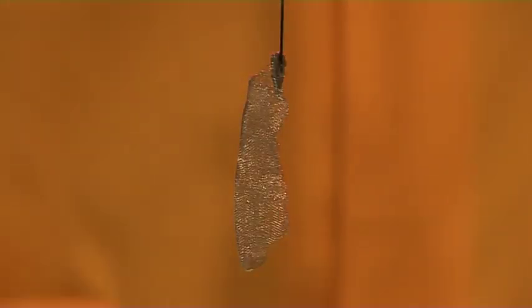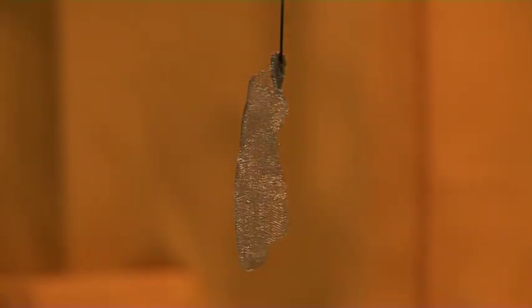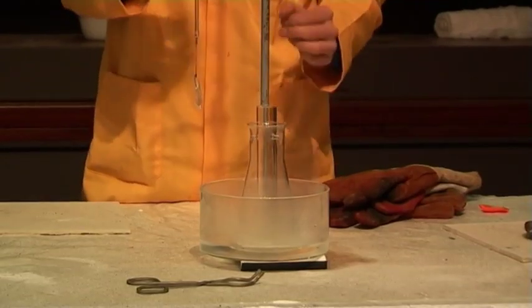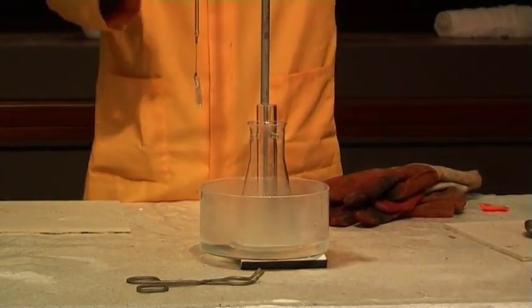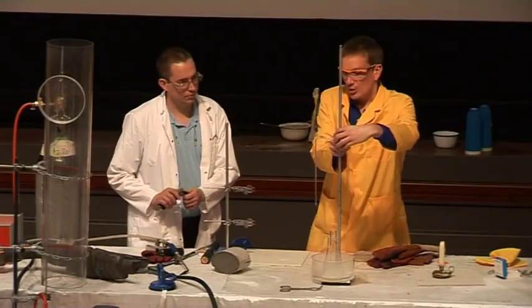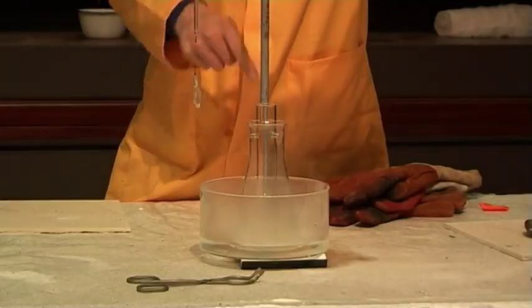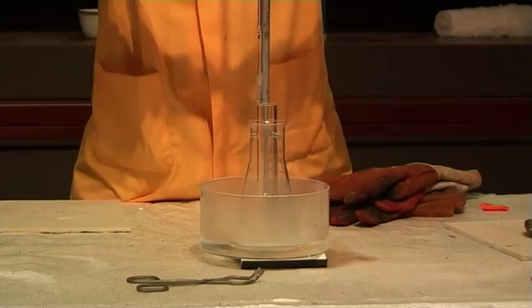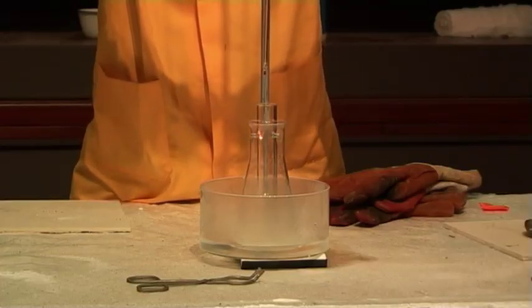Now we have another metal catalyst here. This time it's platinum. And in the flask here we have methanol. It's an alcohol that burns. It's the same alcohol that we started with the coloured flames. We're just going to warm up the catalyst, the metal catalyst, the platinum here, and then lower it into the methanol vapor.